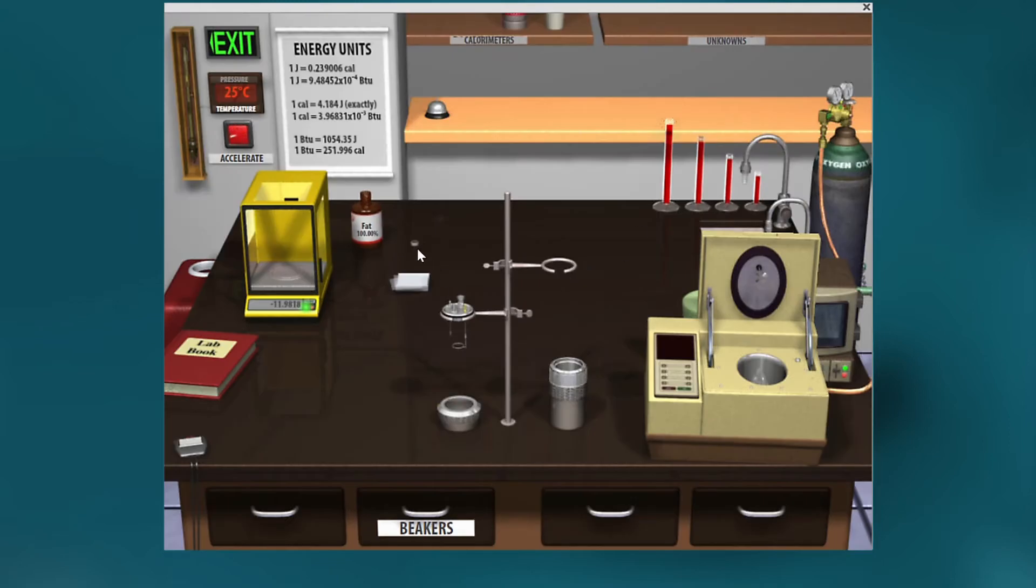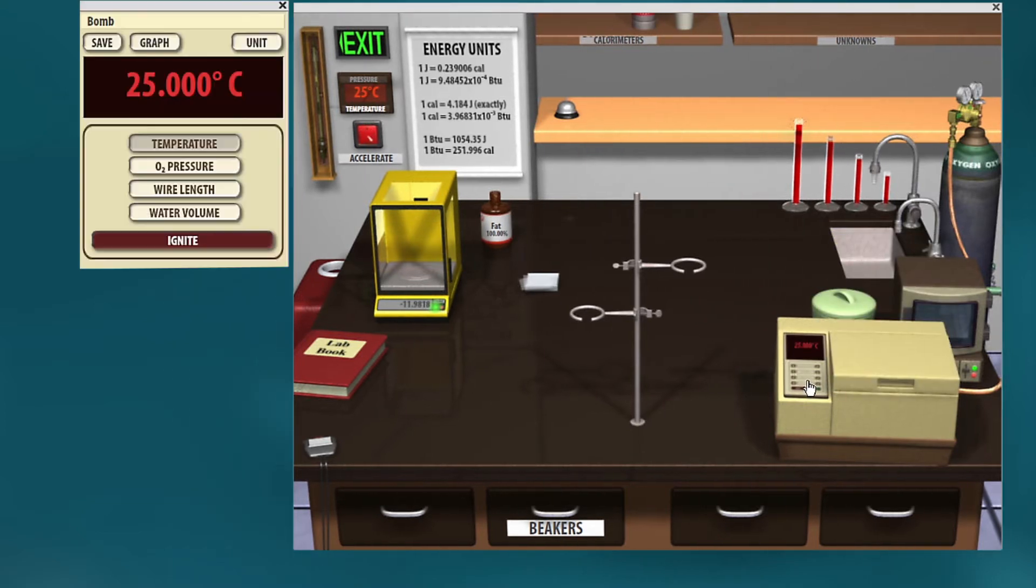And then we're going to load that into the calorimeter, which then we can ignite the fat and watch how much energy is released by how much the temperature raises of this water.